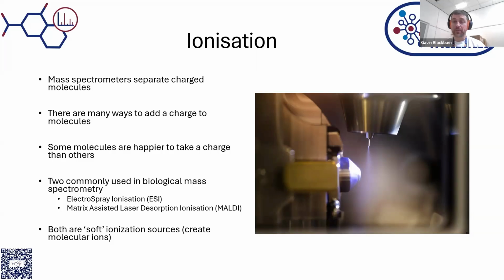When we are talking about biological mass spectrometry, and again, that's what I'm going to focus this talk on, because that's what we do here, and particularly the untargeted analyses that we do, what we are generally trying to do is pull out molecules from a complex mixture. Someone's given me a serum sample or a piece of tissue, or an extract from a particular engineered cell line, and they want to know what molecules are found in there. So what we are trying to do is get signals in our mass spectrometer for all of these different molecules.